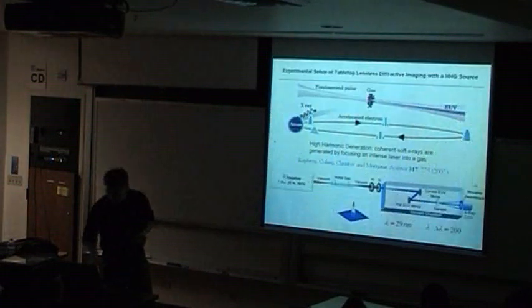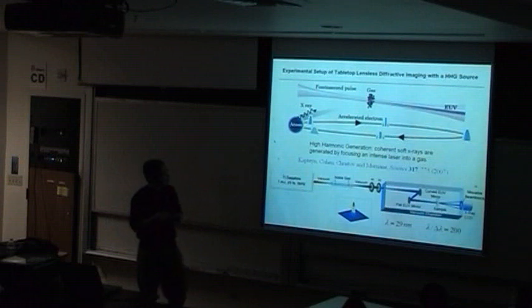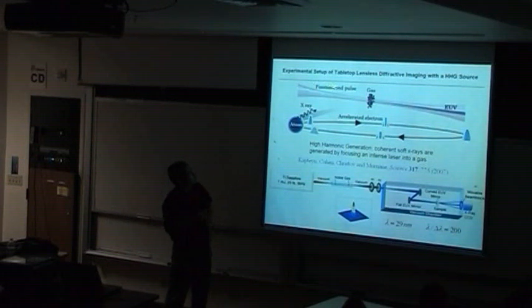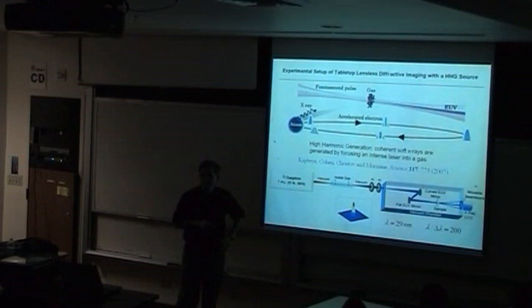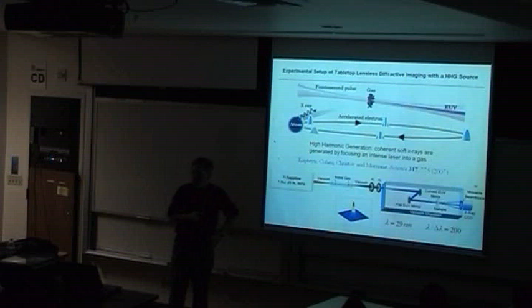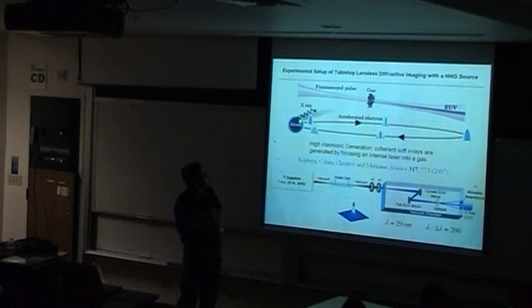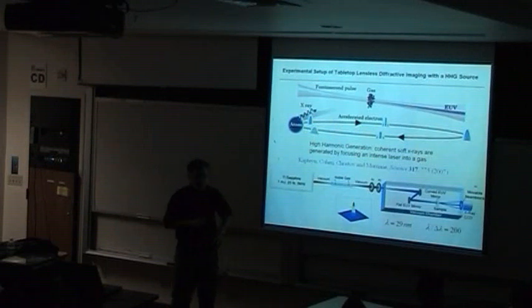Now I'm going to talk about the project collaborating with Margaret and Henry. I felt very fortunate that we started this project, and we first did lensless diffraction imaging experiments with a high harmonic source. At that time, Richard Sandberg, who graduated and is now a postdoc at Livermore, and I did it together. I used a high harmonic generation source, which is a beautiful technique. Two world experts are sitting here, so I'm not going to talk about the principle of this.